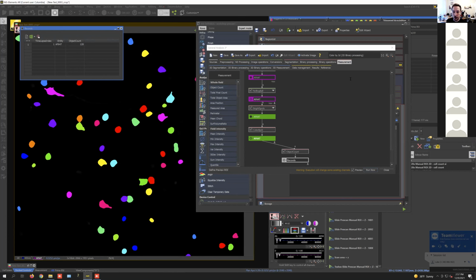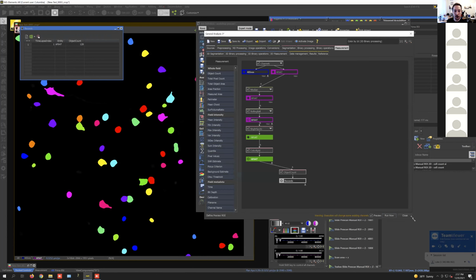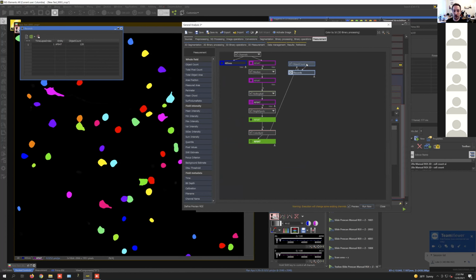It also starts to get a little bit busy here as we build things. So you can hold down Shift and drag if you need to select a couple of things. That way you can move them. Maybe we want to move them here so it's more of a vertical process. And maybe to make room, I can just select this and bring it all the way back up here. So we start with the analysis side of things on this column. Okay, so we have our object count.